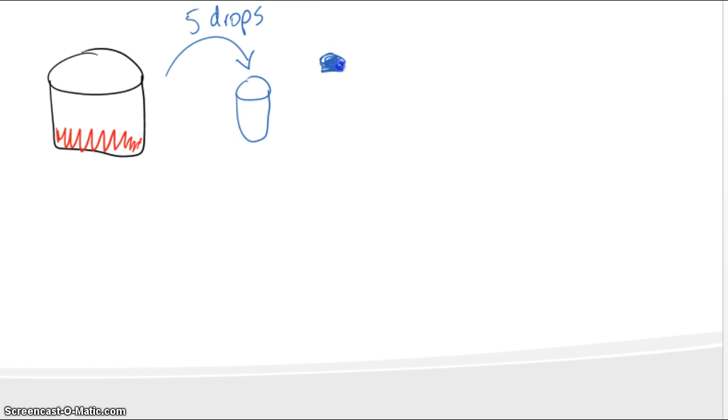Doesn't that look like a tablet? Well, okay. So, more or less, that's our tablet. We added our tablet and we waited for our color change, right? And if we were lucky, we got a color that showed our wine was less than 1%, and that's in our range. We can tell the difference. But if we were unlucky, we had a value that was greater than 2%. We had that nice orange-yellow color, which looks beautiful, but it says our wine is greater than 2%. And so we're outside the range that can be tested by our Clinitest.